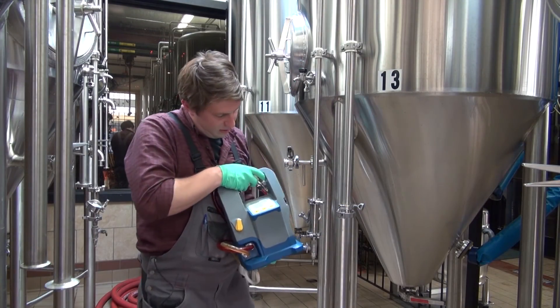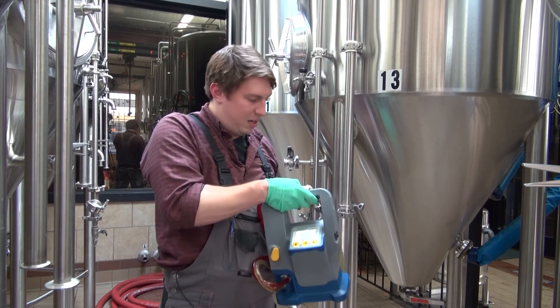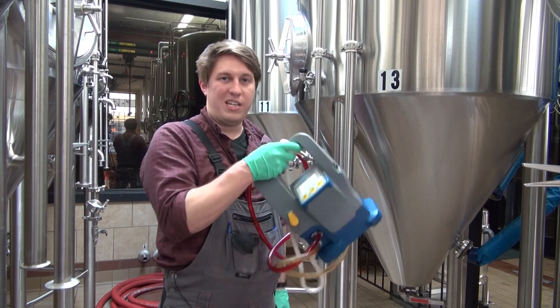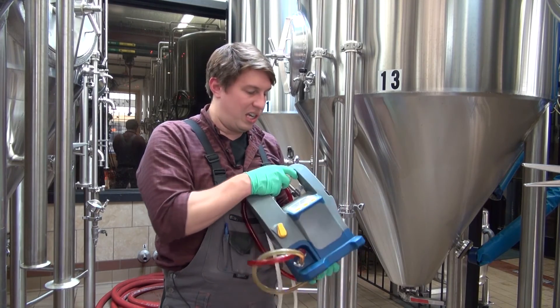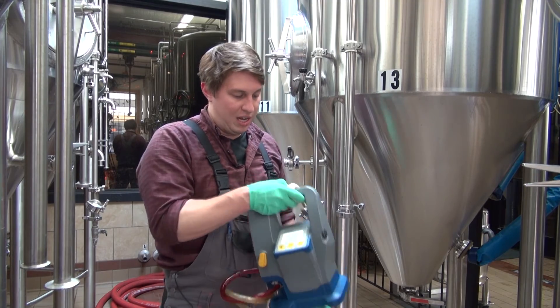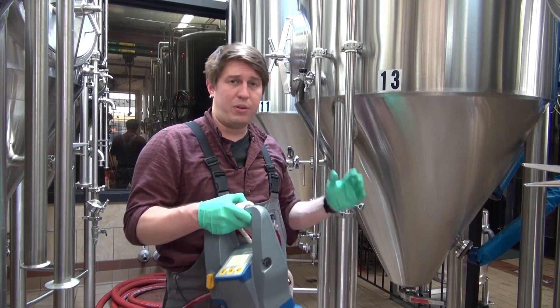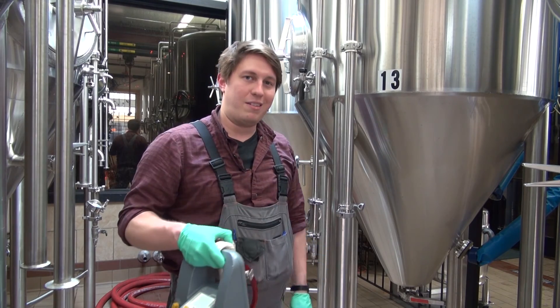Alright, so there it is — the Beverly by Hamilton in action. It's portable, it's lightweight, easy to charge, holds a long charge. Keep it in your cellar, keep it over by the brewhouse, wherever. It's a great tool that makes documenting for QC super easy. Definitely check it out.